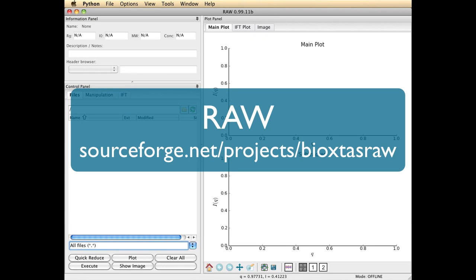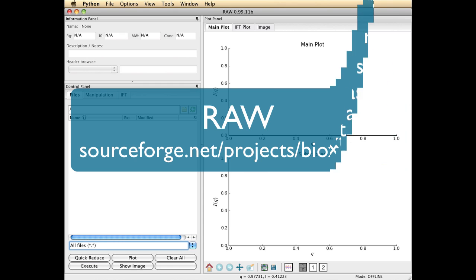Welcome to RAW. RAW is a powerful open source program for processing biological small angle solution scattering data. RAW runs on Mac, Windows and Linux and is available through SourceForge.